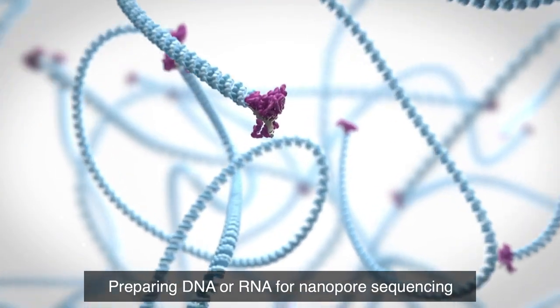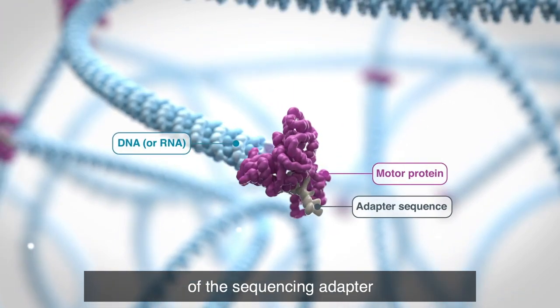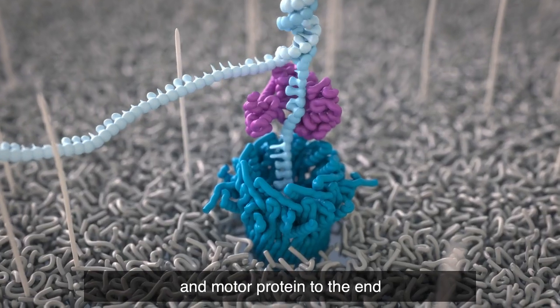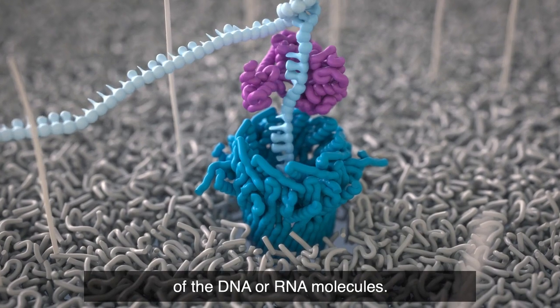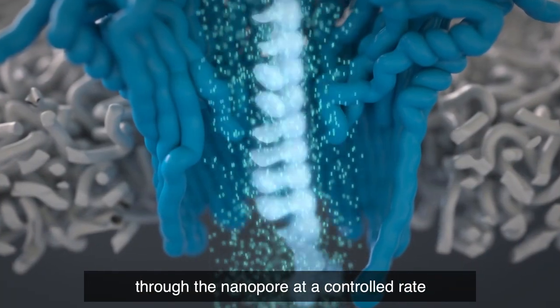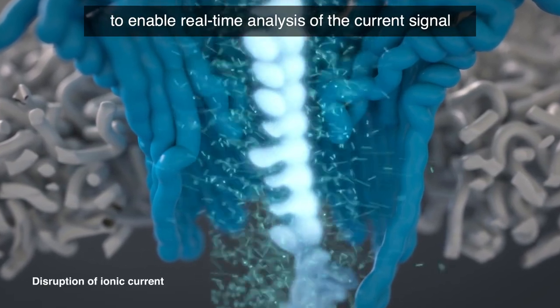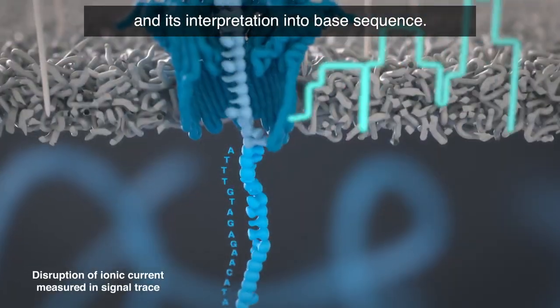Preparing DNA or RNA for nanopore sequencing is a straightforward process requiring the addition of the sequencing adapter and motor protein to the end of the DNA or RNA molecules. The motor protein feeds the DNA or RNA through the nanopore at a controlled rate to enable real-time analysis of the current signal and its interpretation into base sequence.